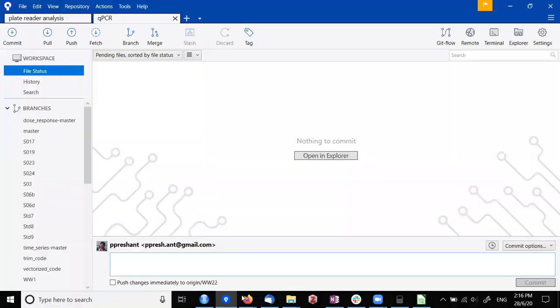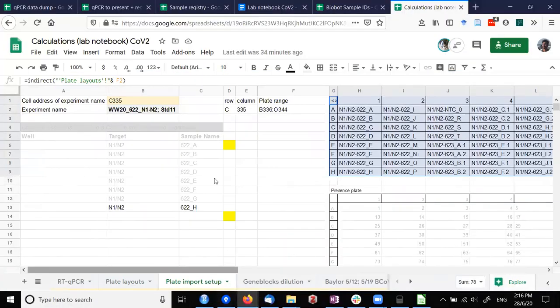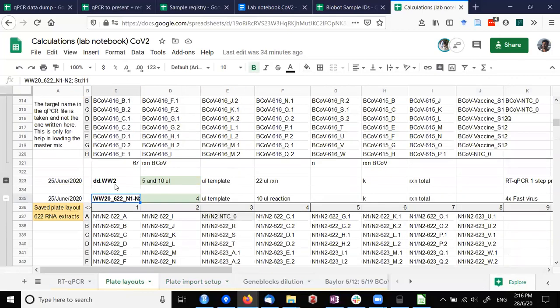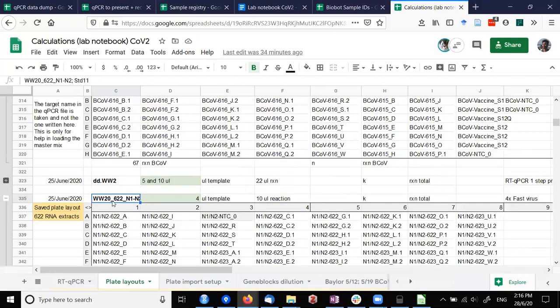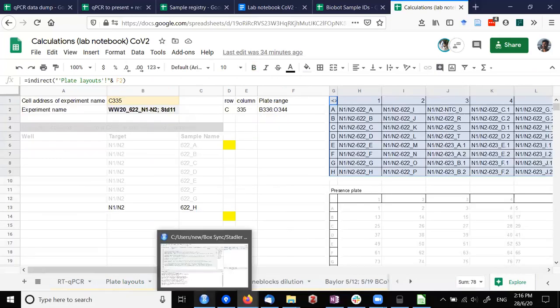Can your code set this? Yeah. Do you manually? Can your code do it? Yeah. If you want to do it through the code, then you just have to do a lot of extra steps. You want to crawl all of these things and then see which name here matches your file name. And that's a lot of extra work. Okay. So I just thought it's easier to do like a one-time thing.